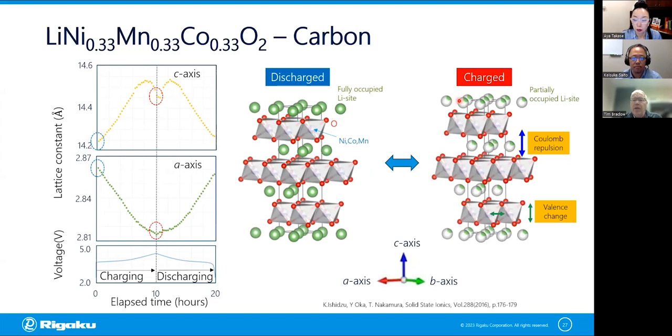One is, remember how you were referring to doing C-rate testing? One C-rate means you charge in 1 hour and discharge in 1 hour. So this question is, if you do a C/20 cycle, can the software handle that much data?